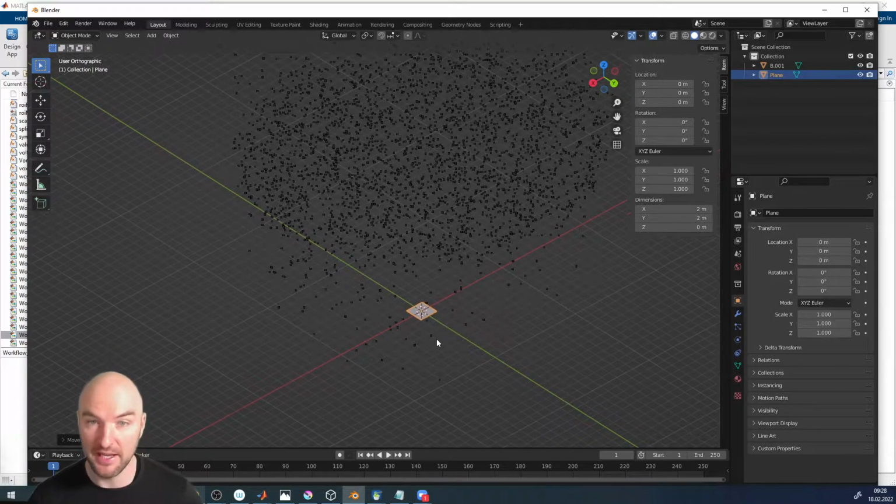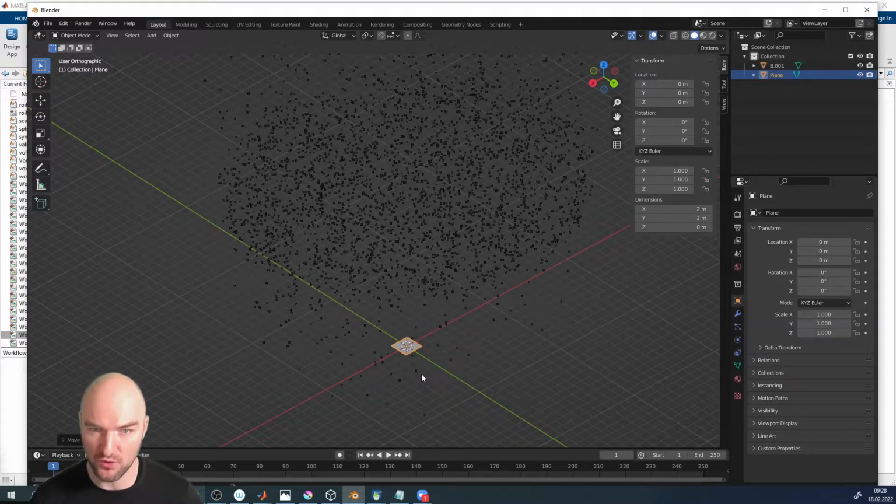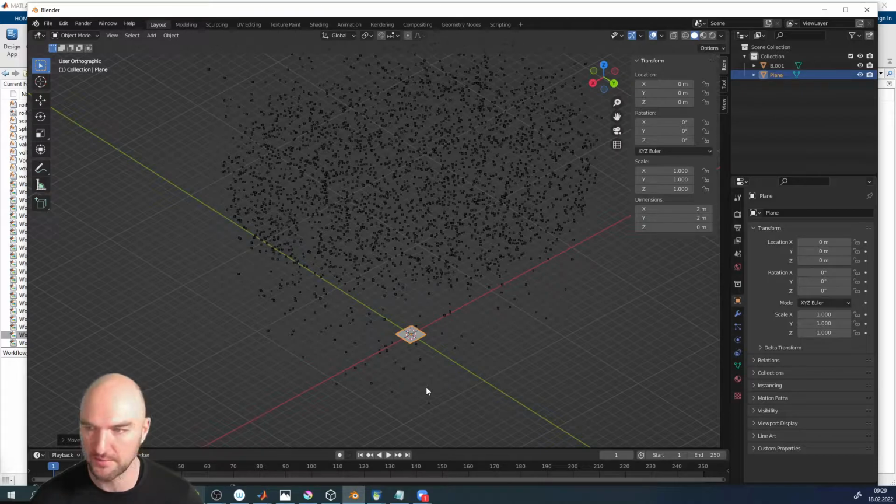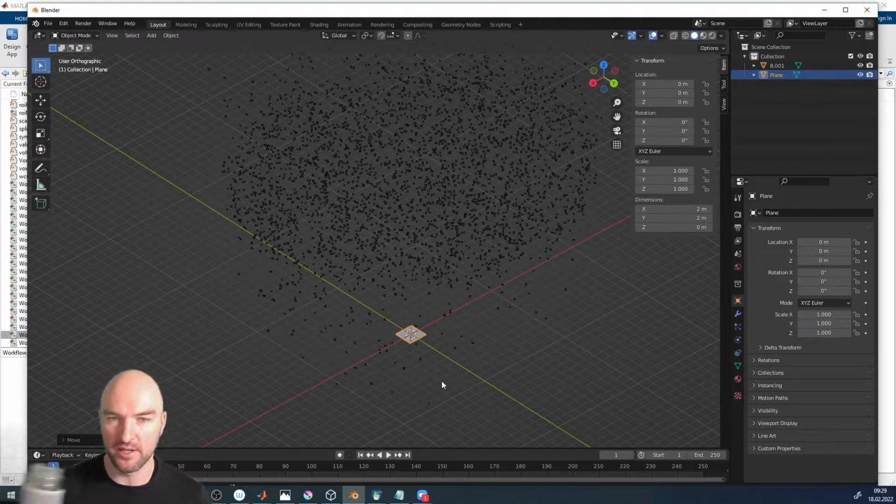Okay, so what we typically want to do is ideally keep the origin of all of our objects the same. So keep it at the world origin. So what we are going to do is move the vertices, and we're not going to move the object. This is not 100% necessary, because we can also move the object as a whole, and when we export it, it's kind of made sure that the vertex allocations are relative to the world origin and not relative to the object origin.